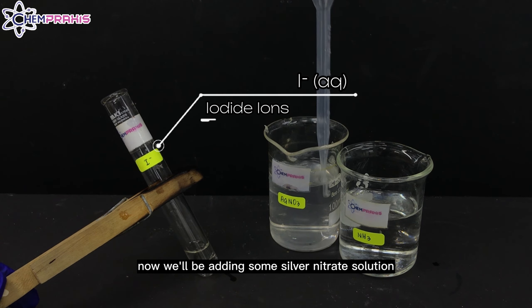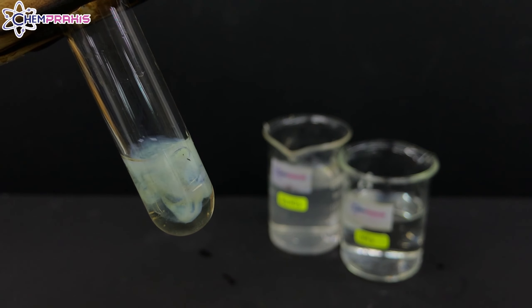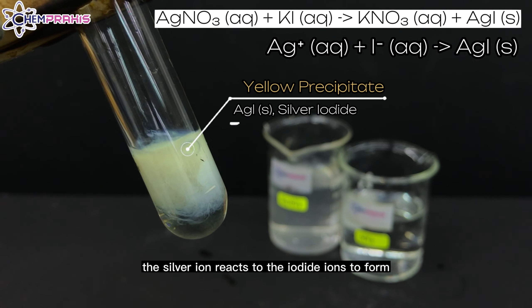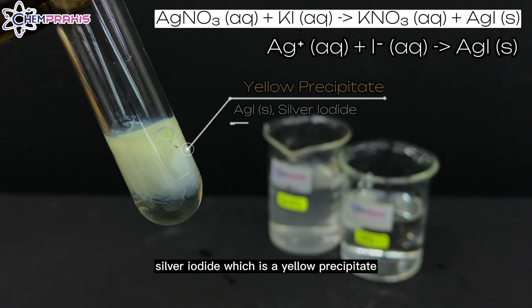Now, we will be adding some silver nitrate solution to the iodide ion solution. When silver nitrate is added, a yellow precipitate forms. The silver ion reacts with the iodide ions to form silver iodide, which is a yellow precipitate.